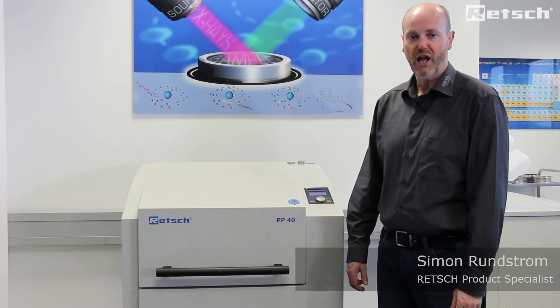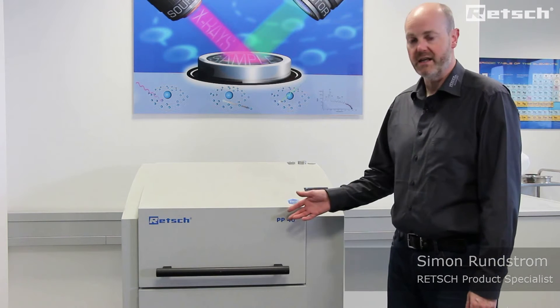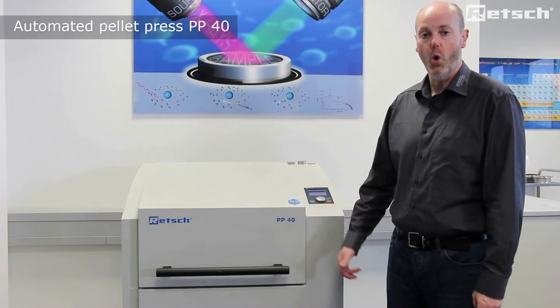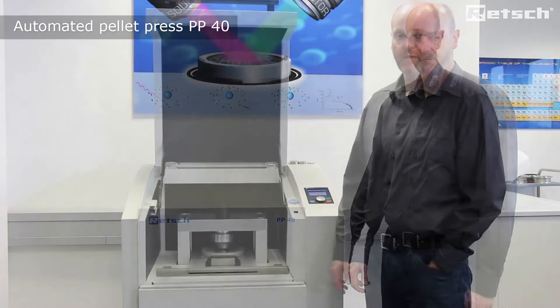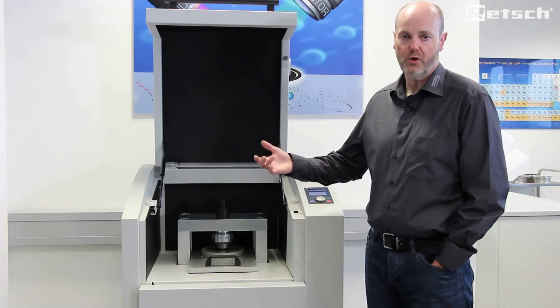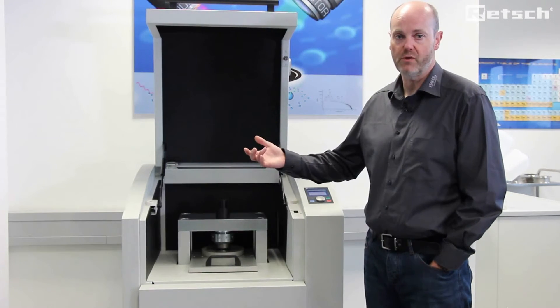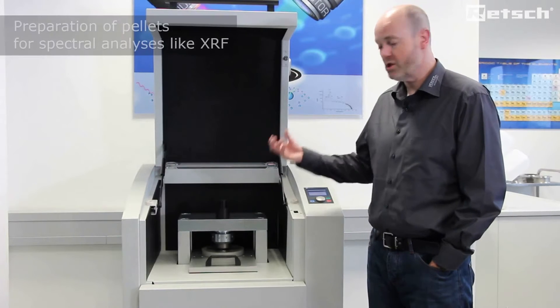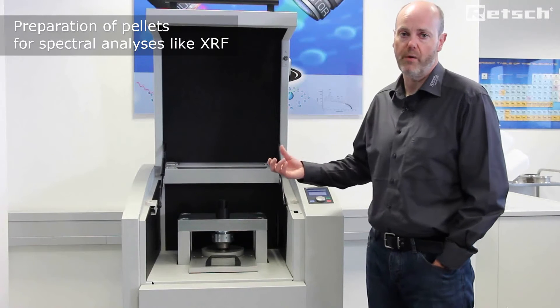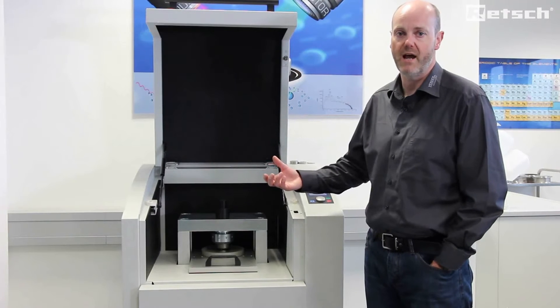Hello, I'd like to take this opportunity to introduce the floor standing PP40 automated pellet press. The PP40 can be found alongside laboratory mills such as our RS200 or RS300 vibratory disc mills for the preparation of pellets for ongoing spectral analysis via XRF in many different application areas.